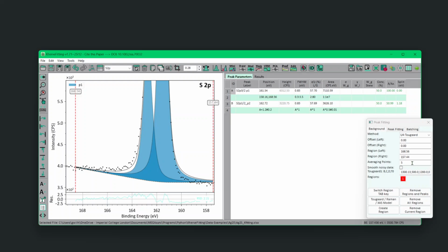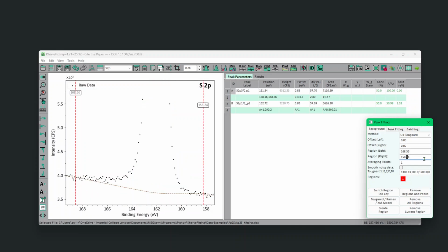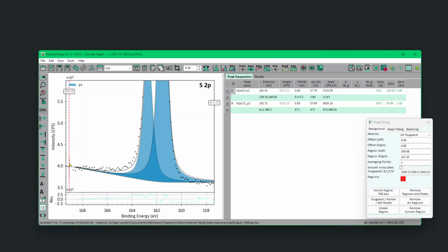And if it doesn't, then we will put one. Maybe that will do something. And we can also move that using our cursor. So let's just go one at a time, like that, until you find something good. Come on. Yeah, I think. Okay. Somewhere around there. And now obviously this is too high.